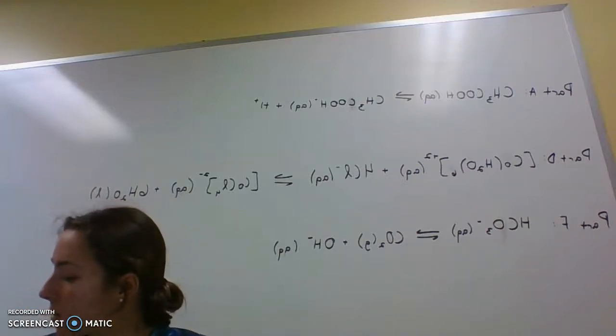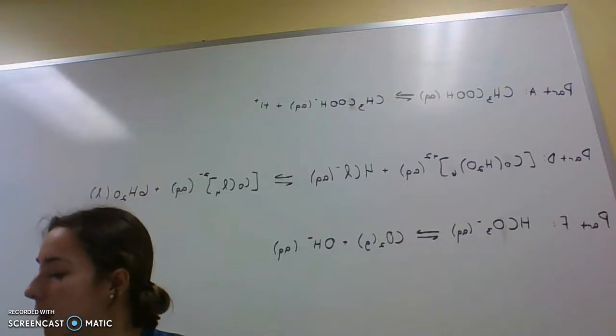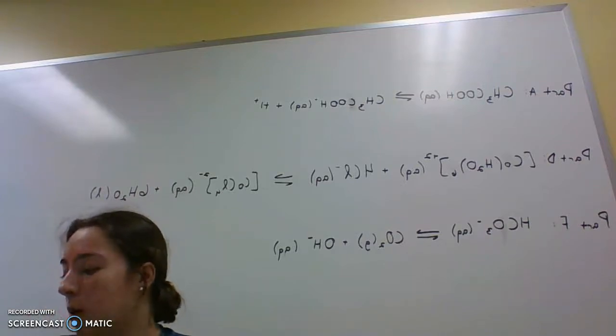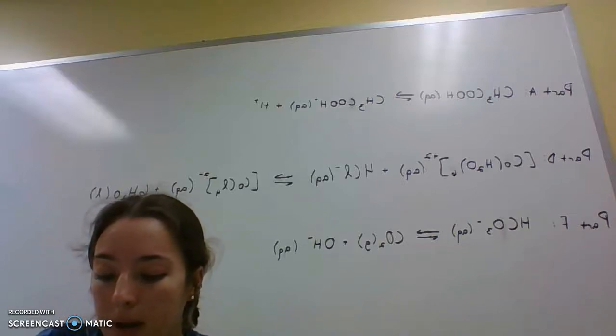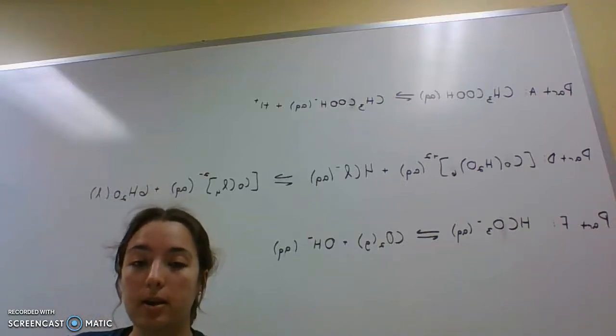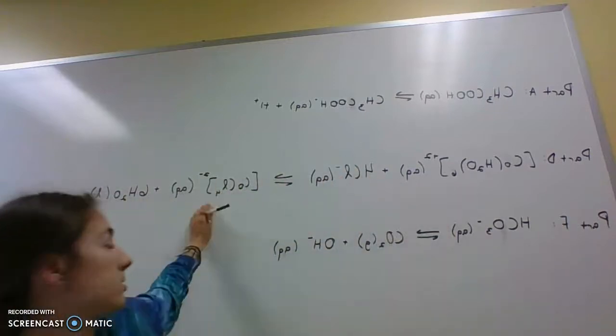Part D was cobalt/cobalt chloride equilibrium. So the first part was, what color is the Co(H2O)6 2 plus ion? That was pink, and the CoCl4 2 minus ion right here is blue. So this is the pink one, this is the blue one.